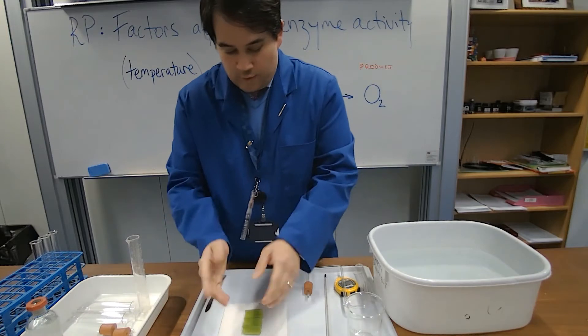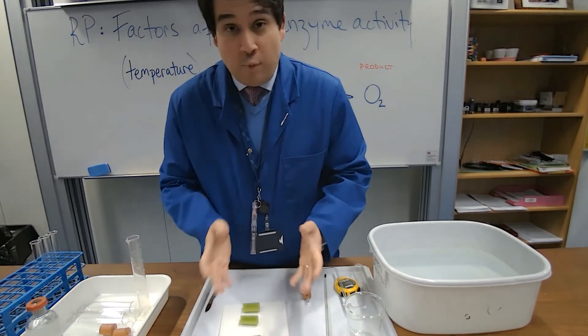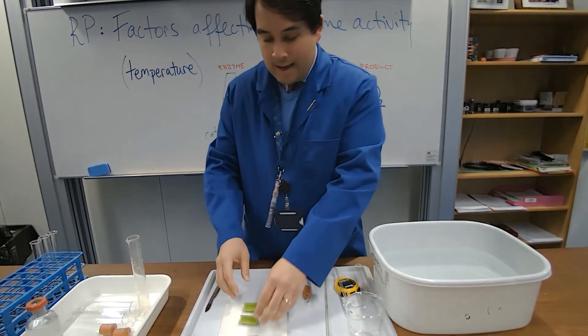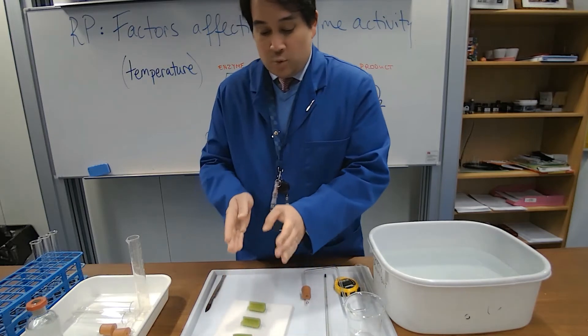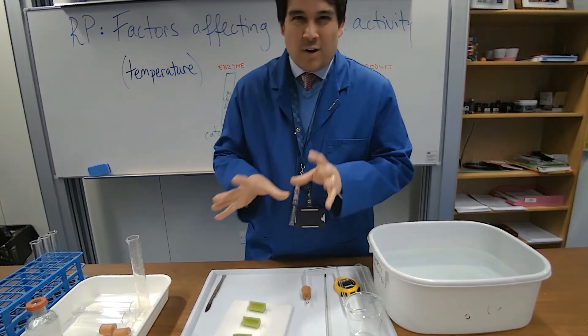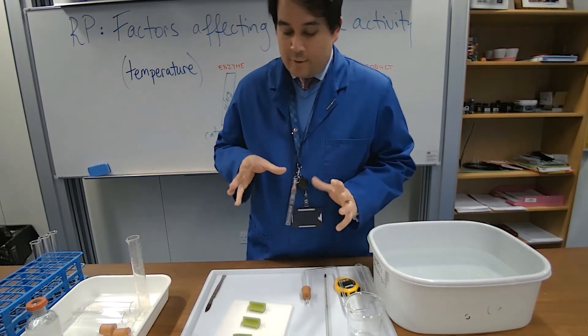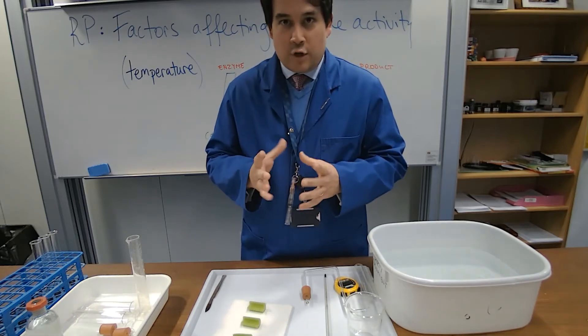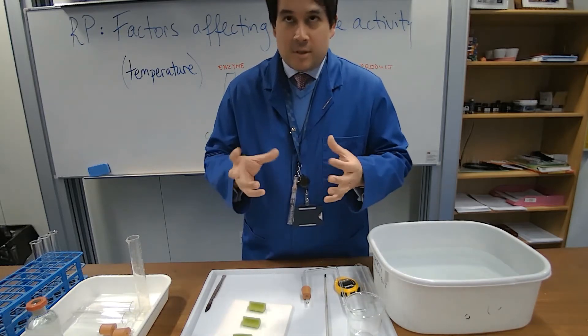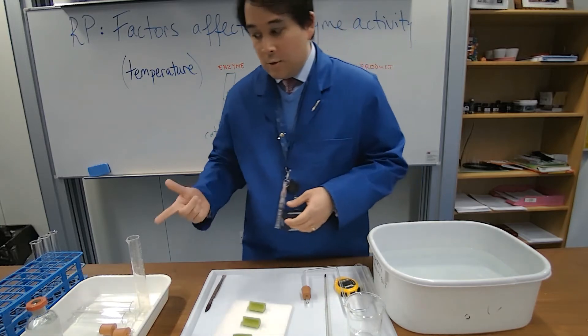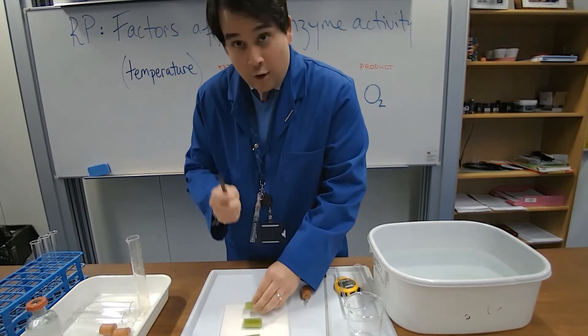Right, so what we've got here, three pieces of celery. I've tried, I'll weight them out, same mass. And then I'm going to cut them up, it's quite a crude experiment, this. But I'll try and cut them up to the same sort of surface area, so similar bits of celery are exposed to the solution. So I'm just going to give that a go first.